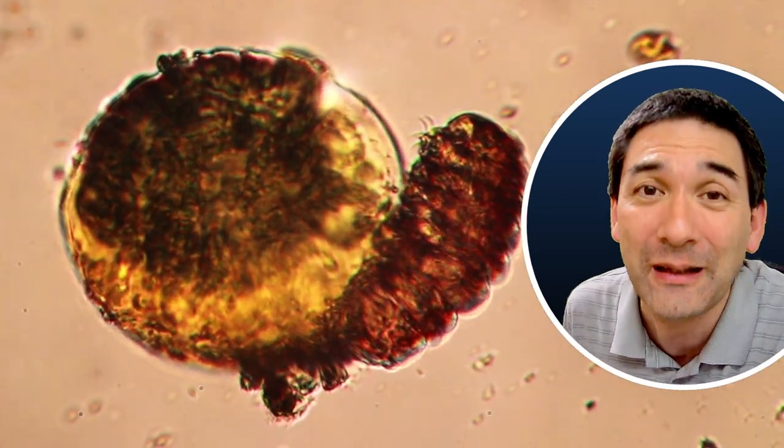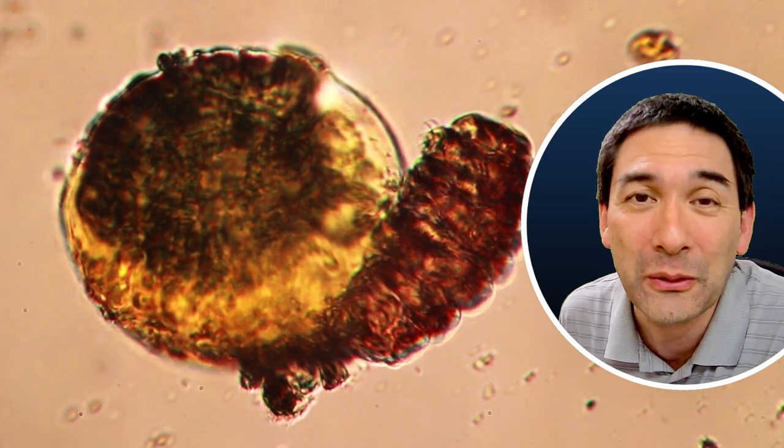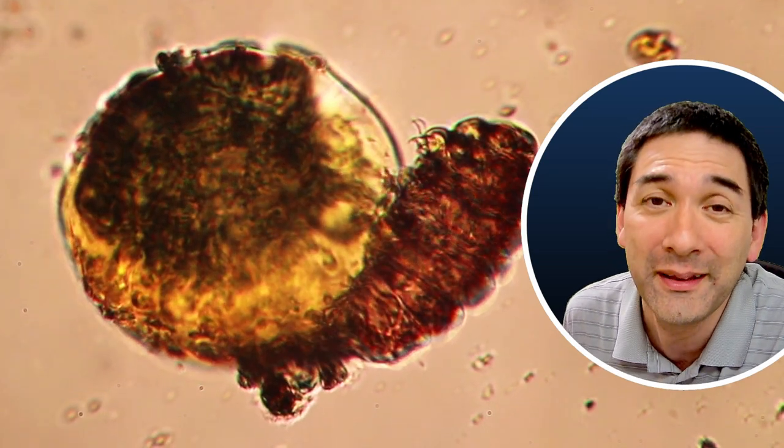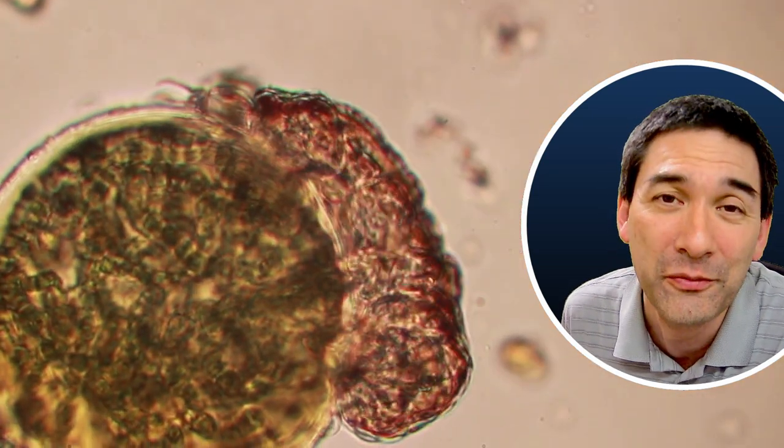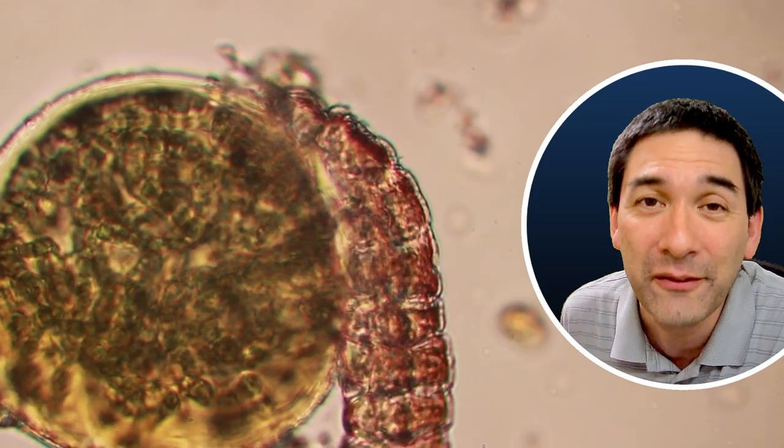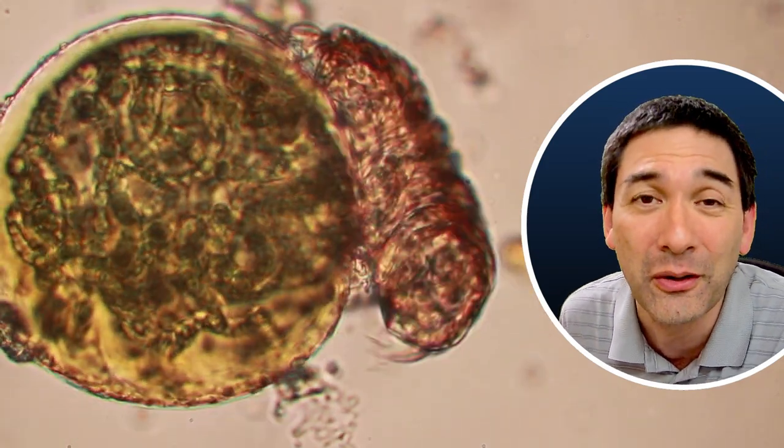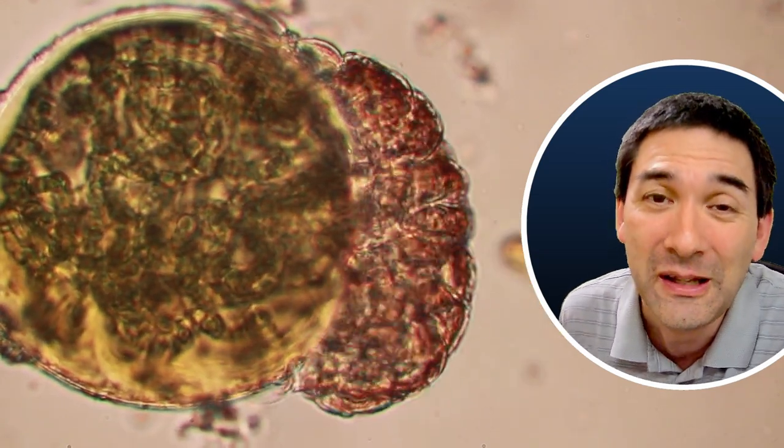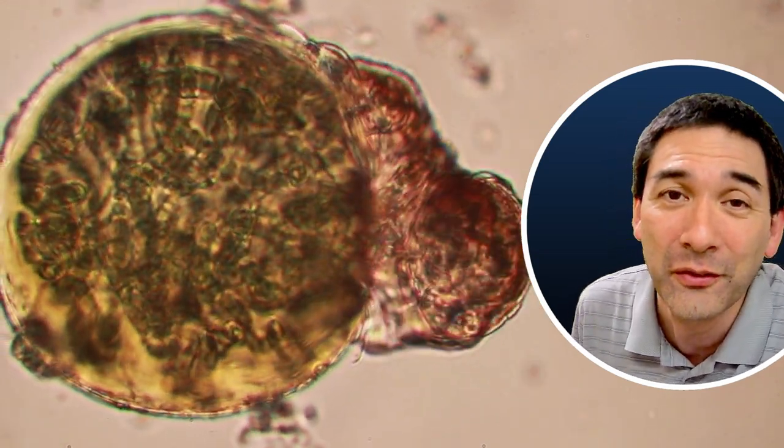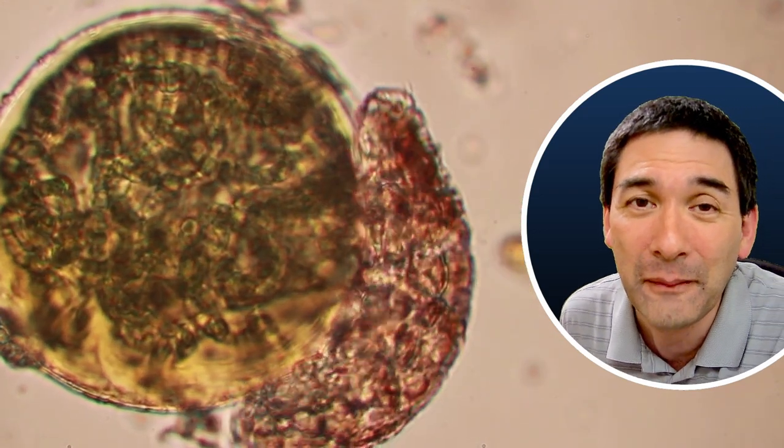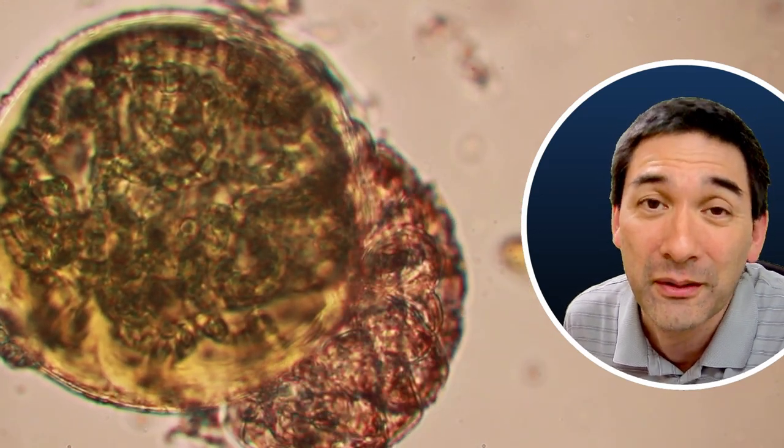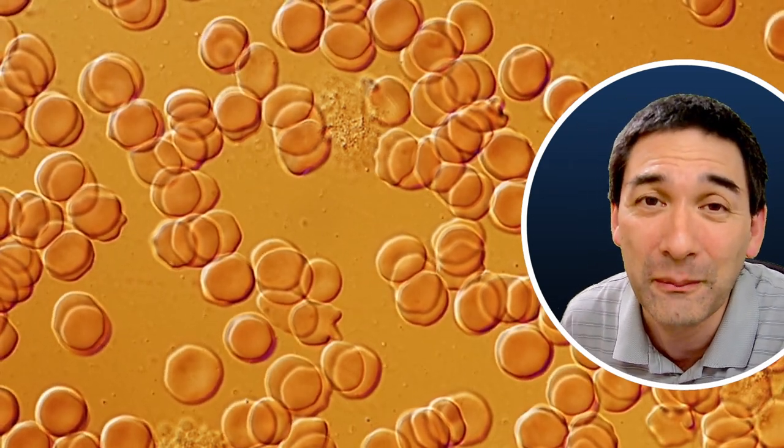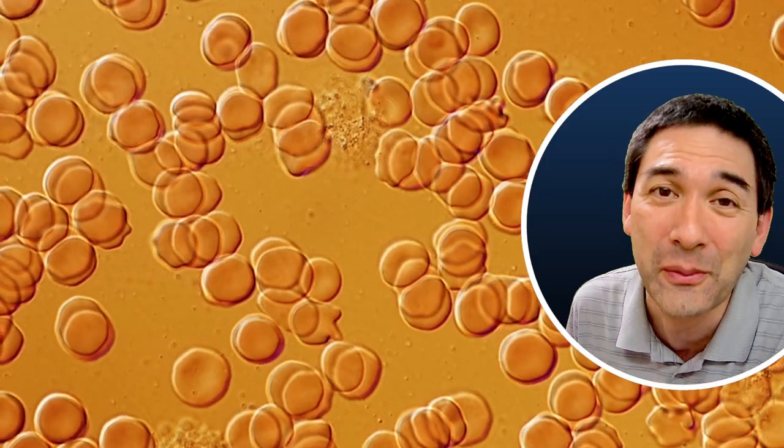And last but not least, a very favorite little organism here, that is a water bear which was completely dried up and then I added some water, and after a couple of minutes it came back to life again because water bears are after all quite resilient and are able to withstand dryness quite well. So you can see that during the month of May 2023 I published a few videos, live streams as well, YouTube shorts, and again if you're interested in watching them, then I put the links into the description below.